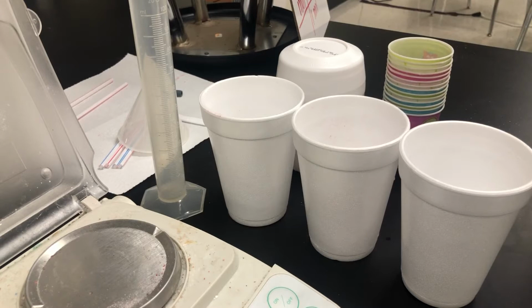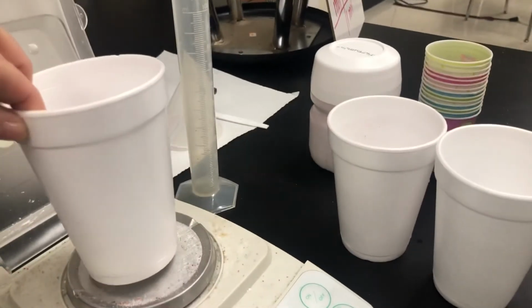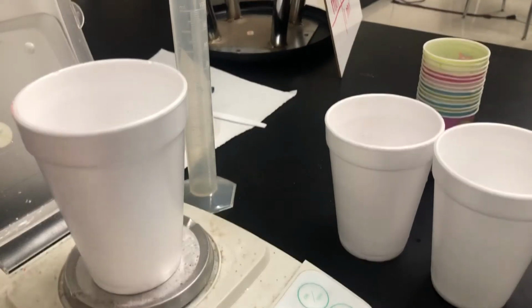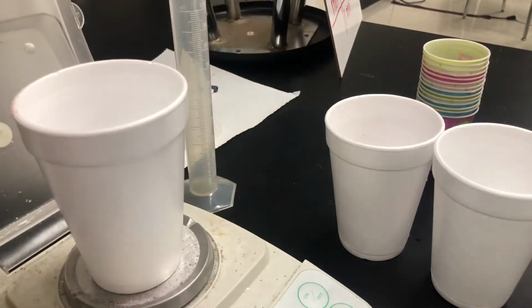And so here's what they're basically going to do. It says transfer the measured amount of Kool-Aid powder into your mixing cup. So I'm going to put my first mixing cup on here. I am purposefully not showing you the balance screen because you have to calculate how much I am putting in there. And so I'm going to weigh out what I calculated before you got here.